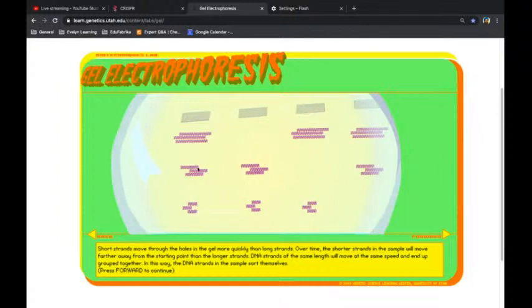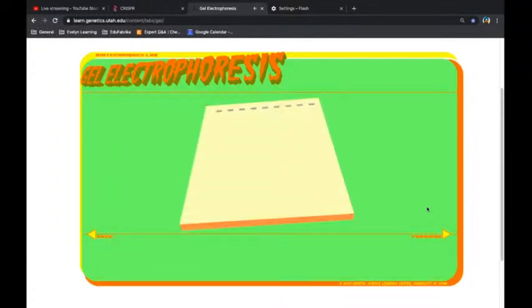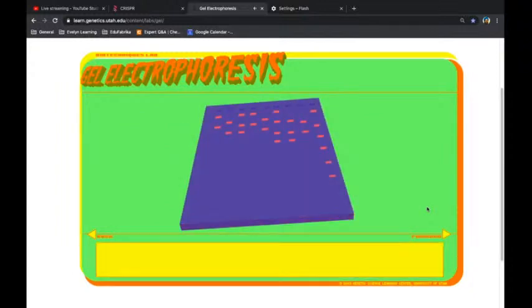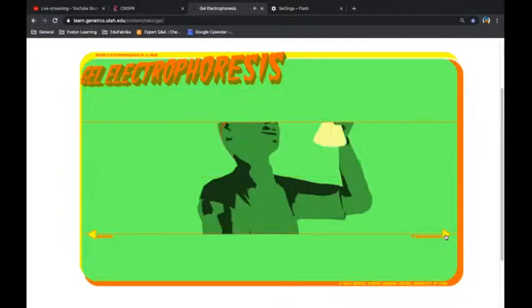Some has short, middle and longer. It has only short and middle. It has short and longer. It has middle and longer. So according to that, they are all separated. Further, after the staining, we can check each type, like where and how much stained the DNA is. We can check them like that.